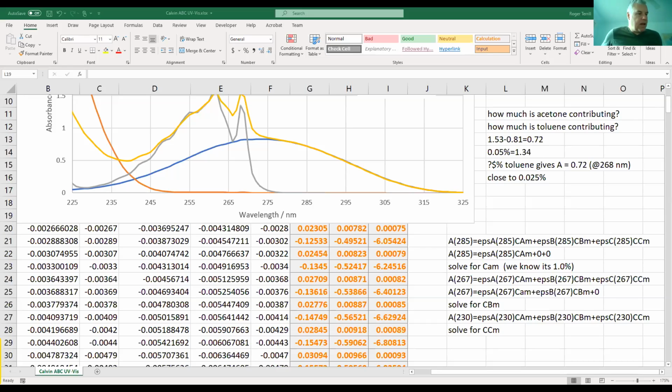So the 3 solvents here, A, B, and C, are all absorbing, right? And then the mixture also shows that independent sum, right? And so we know the standard absorbances here, AA, AB, and AC. Can you guys see this, for example? I don't know if Abby can see it, but hopefully.